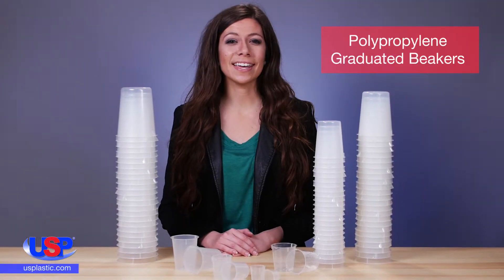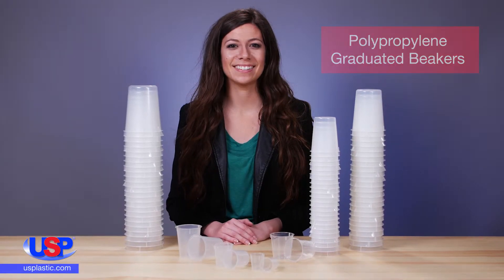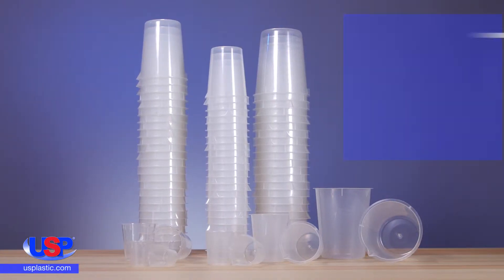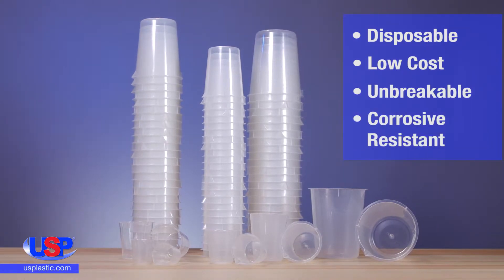At US Plastic, we offer a wide selection of beakers available in a variety of materials to meet your laboratory needs. Our polypropylene beakers are disposable, low-cost, unbreakable, and very corrosive resistant.